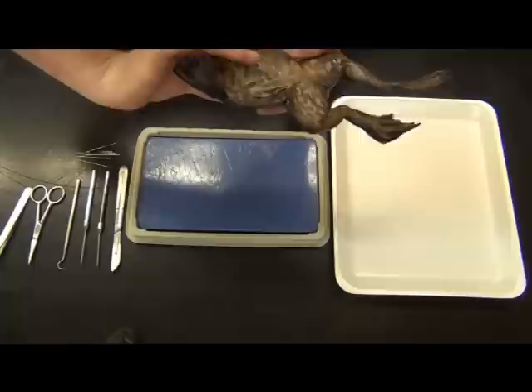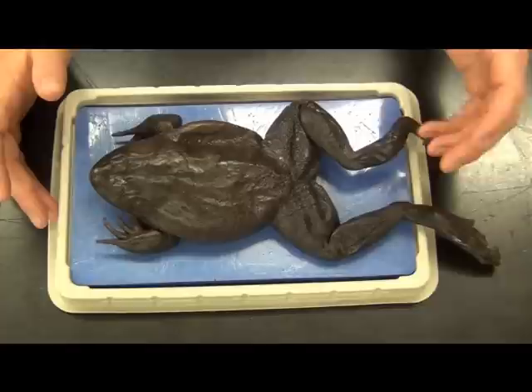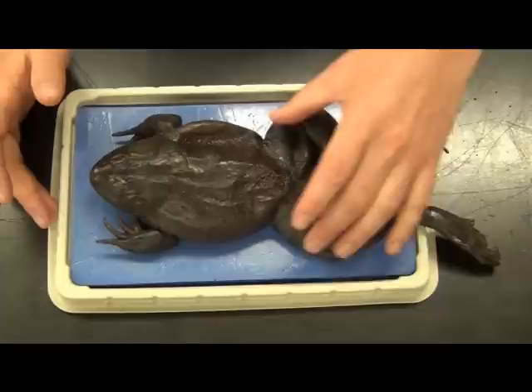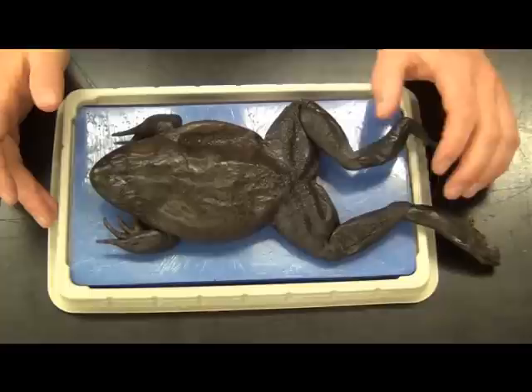Let's start with the external features. Externally this all looks fairly familiar — we have our standard tetrapod body plan: two arms, two legs, your cranium housing a very small brain, some eyes, some nostrils, and the mouth. We've grown up with this kind of thing. But as they are amphibians, we're going to see some differences from these guys and our mammalian counterparts.